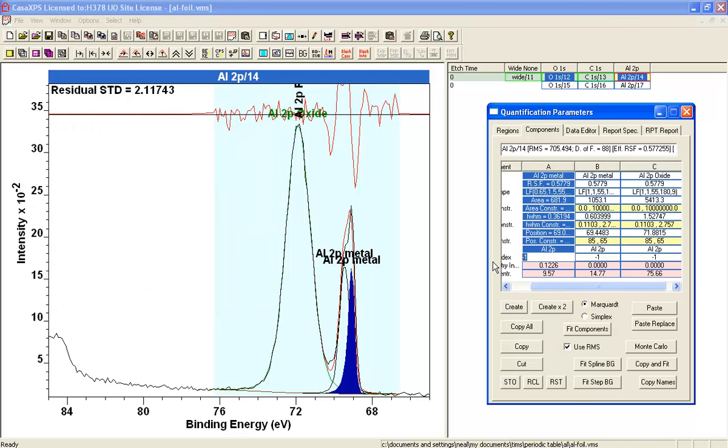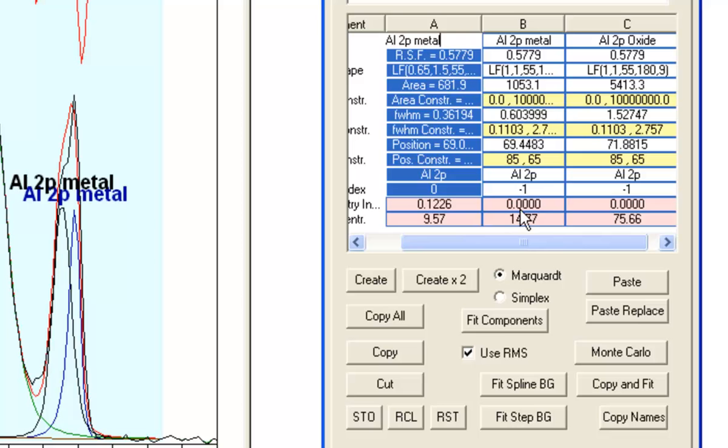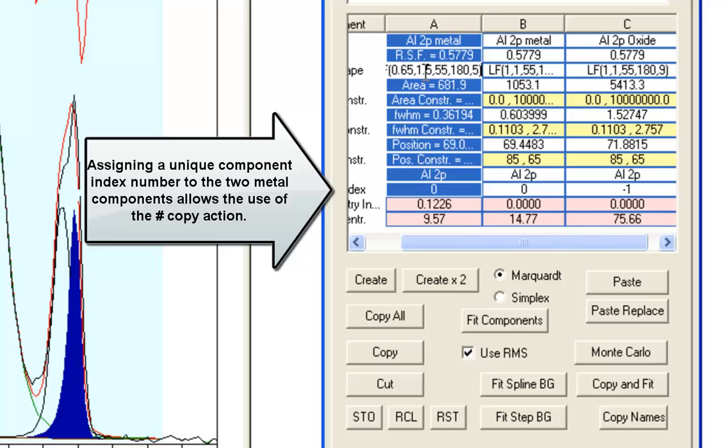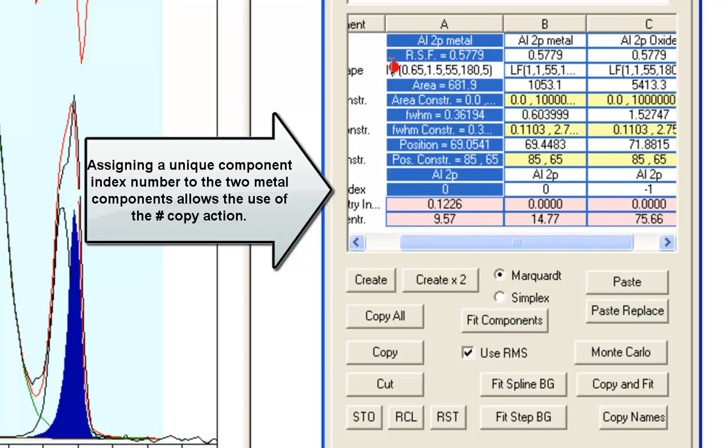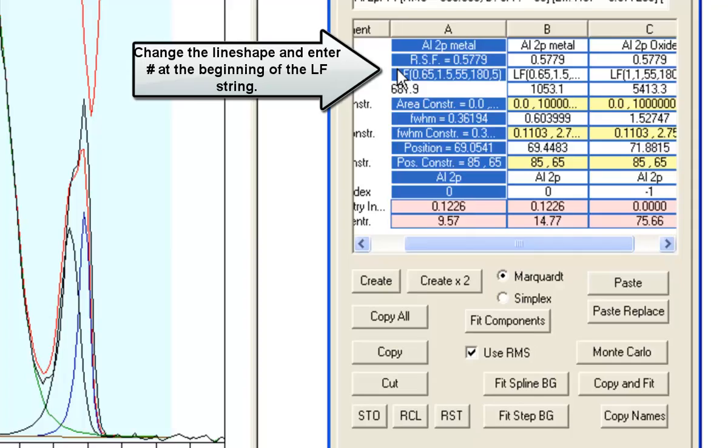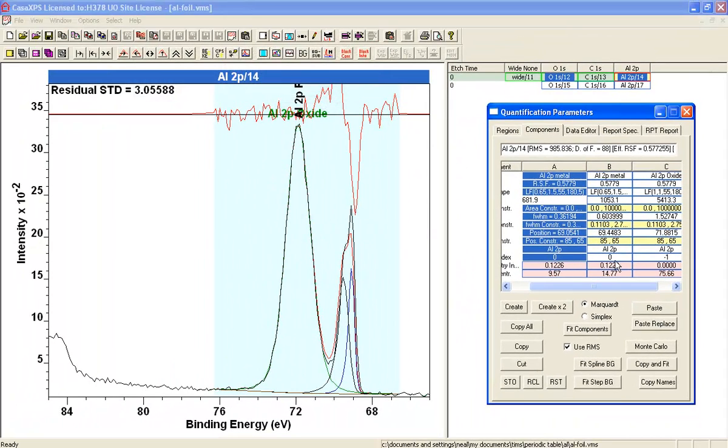And what I'll do is I want to propagate that to the other peak that I'm assigning as a metal. So I can do that by entering at the beginning a hash and pressing return. It'll say update all components with the same component index. I say yes, and that's why I changed these to have the same component index. So now I've got two components with the same line shape and I can say fit.